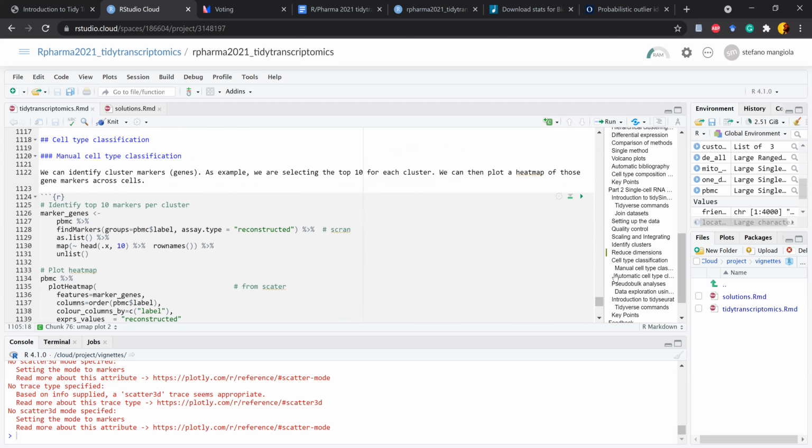Okay, so some of the last steps here that I will show you today. After we identify clusters, we might want to classify those clusters. So understand whether a cell cluster is cancer cells, T cells, B cells, and so on. There are many methods to do that. Some of them are more automated. We can also approach this on a purely curation side. And often we do both. I rarely rely just on manual curation or automated methods. I usually use both to gather more evidence.